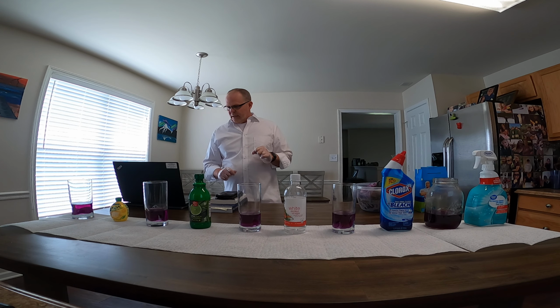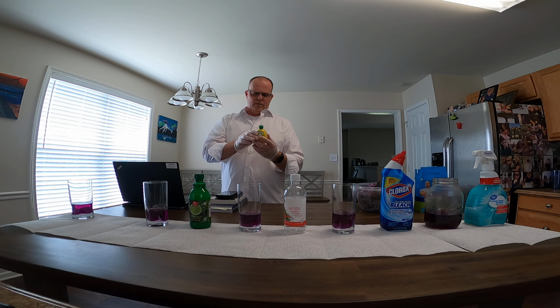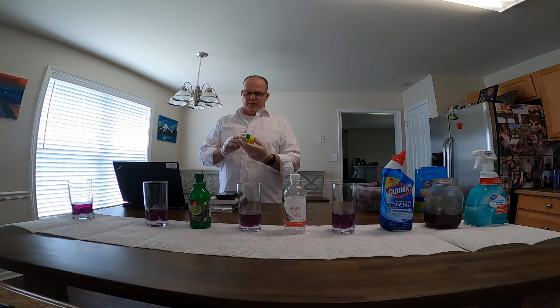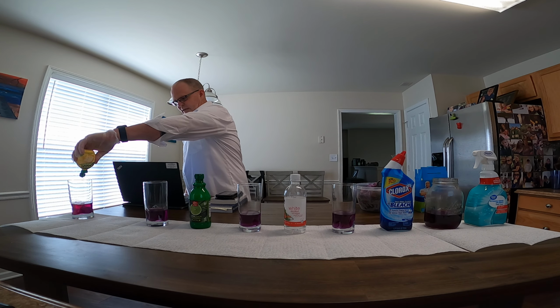So, let's see. I think we'll start with lemon juice. This is just normal lemon juice that you would use to add to your tea or whatever for flavor. And what we're going to do is add some lemon juice.